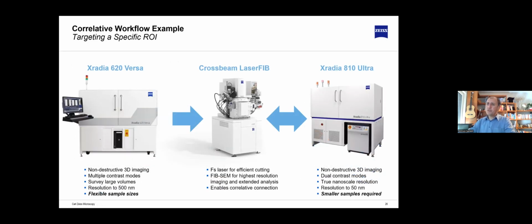So as an example of the workflow, how we can direct ourselves to the right region of interest for TEM lamella preparation. TEM lamella preparation is really important because TEM investigations are really time-consuming as well as expensive. However, the sample preparation step is really challenging because that's the most important step. We would like to have a region of interest included in the TEM lamella. On the other hand, we have a big limitation: in the FIB-SEM that is normally used for TEM lamella preparation, we decide from the surface, and then we cut through, with the hope that the feature is also staying there underneath the surface.